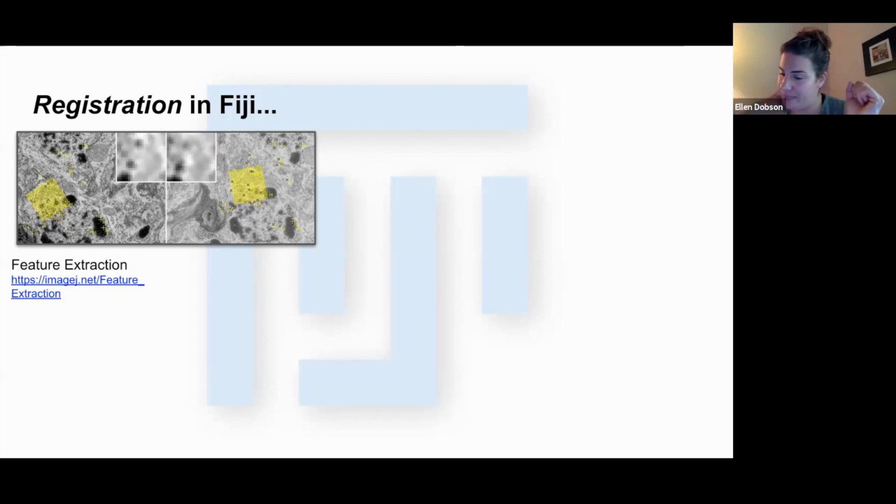And in my case, years ago, I was imaging on a system that had two confocals, and the other I could switch to and do FLIM acquisitions, but the two detectors were two different sizes. I obviously needed to register them over so I could actually see the same cells in both FLIM and my spinning disk confocal.